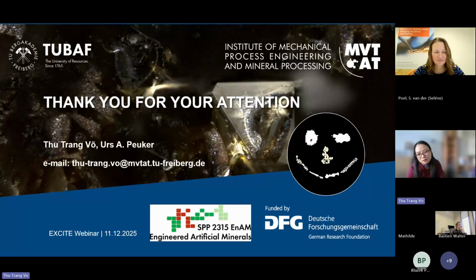It's very straightforward. You just open screws and mount your sample in and screw it again, and then you mount it into the CT. And about the precision of the force, can you adjust an exact number of newtons?